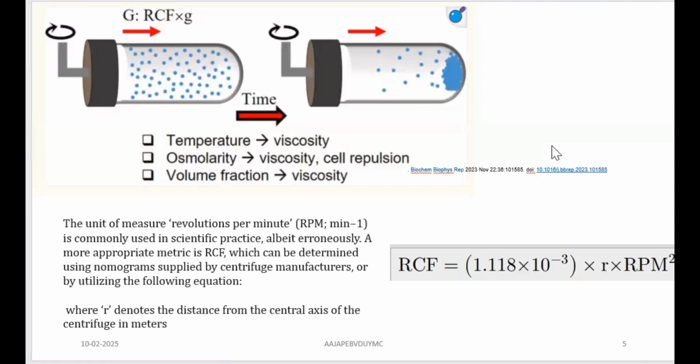Now, here this is my tube which is completely in a horizontal position. Is it going to happen like that? This will happen if my centrifuge is working with a swinging bucket type of rotor, not a fixed angle rotor. So when the tubes are rotating, they will fling out and get arranged at a horizontal angle, and then they will spin. This particular design shows spinning. Against this, if I have a fixed angle rotor, my tube will be held at a particular angle.